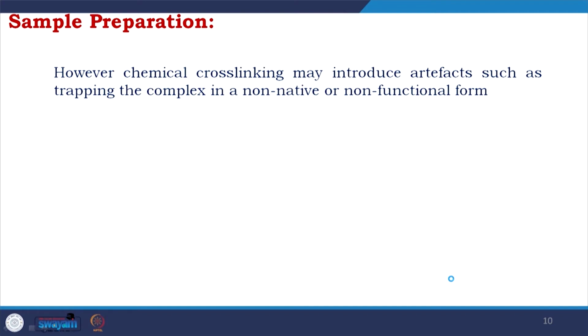So, as I was saying from the initial stage, the correlation between the sequence and function has to be done by structure, but to do that the structure has to provide information about the native state, and that is one of the problems we are always discussing in the case of crystallography.